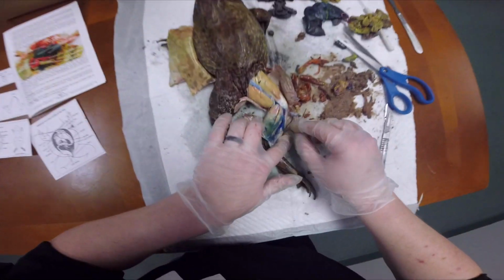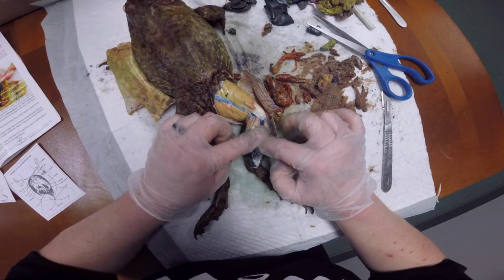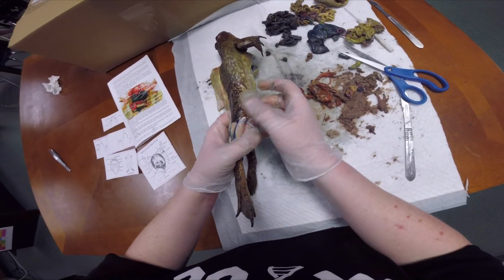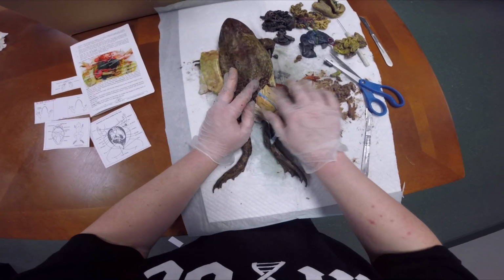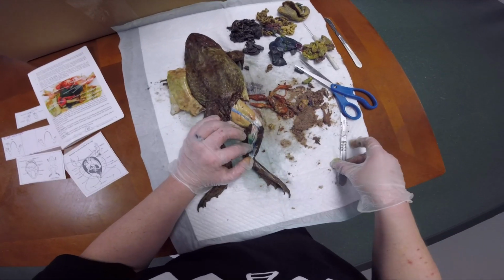There we go. So this would normally be this blue, but you can tell that they went a little happy on the blue dye this year. But here is the kneecap. Okay, so they can extend and hop with their very, very powerful back legs.